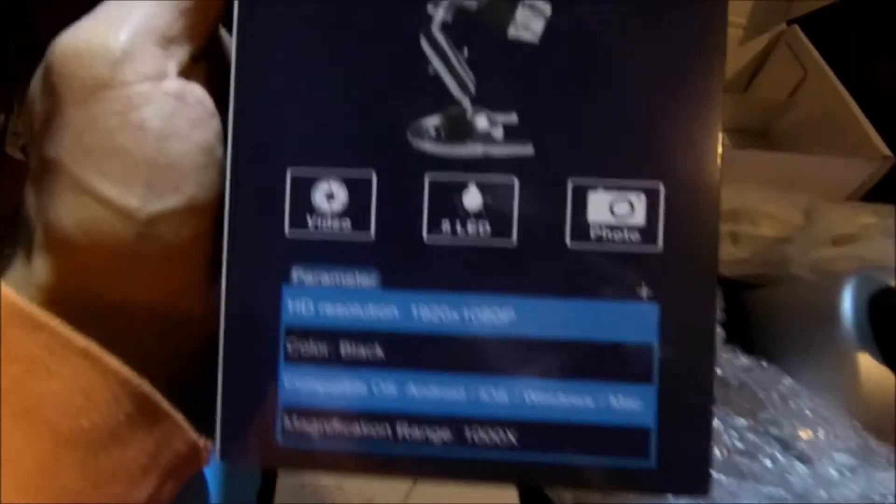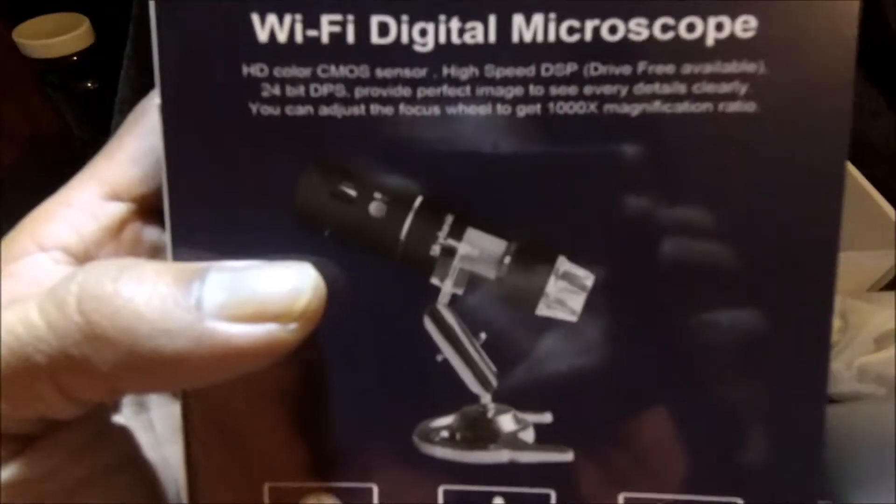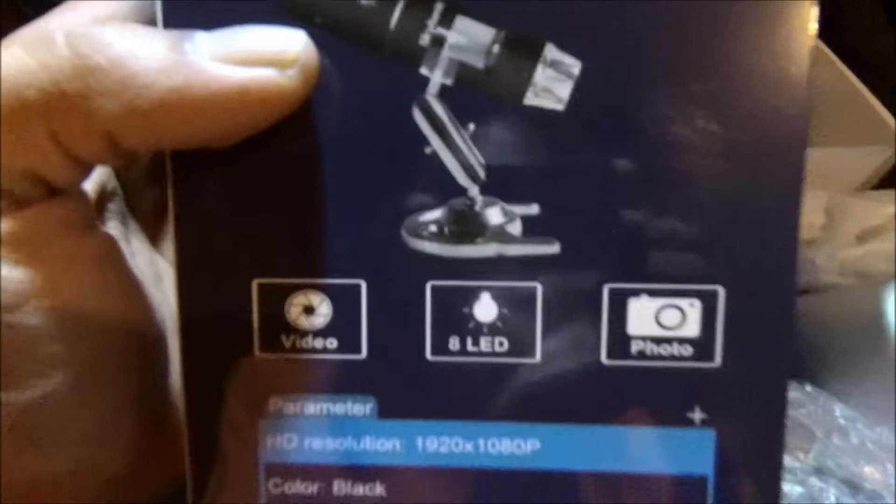So we're gonna check all kinds of insects, plants — I'm gonna go crazy with this. We're gonna check all kinds of things everywhere, I'm just curious. Typically it's up to 1000x magnification, and it connects to your cell phone, your laptop, your PC. Yeah, it's pretty cool.